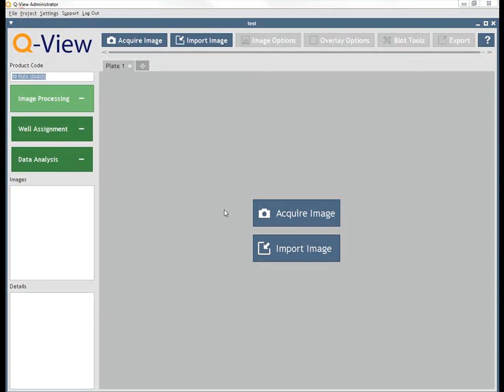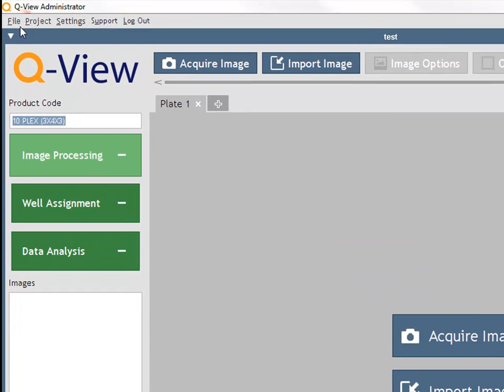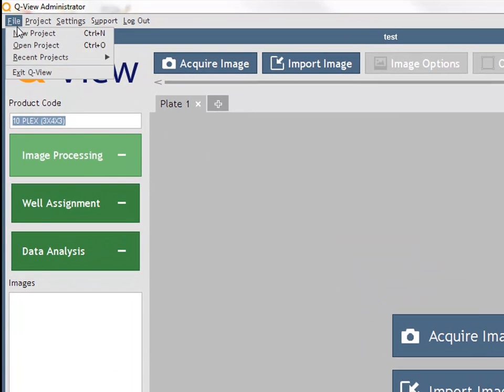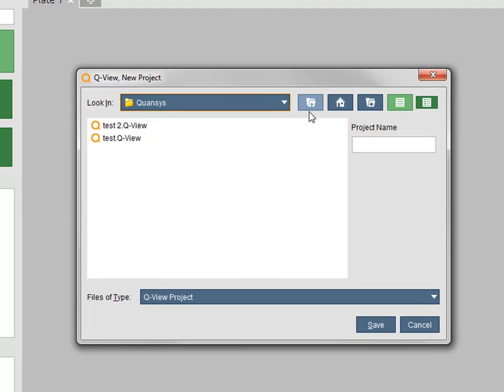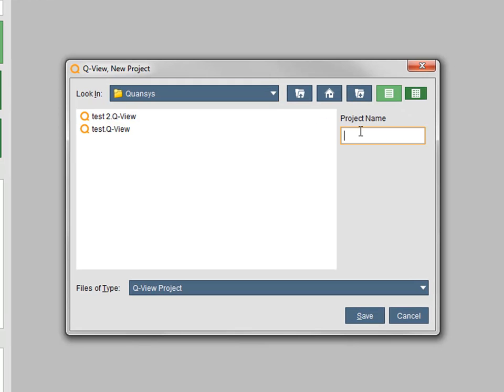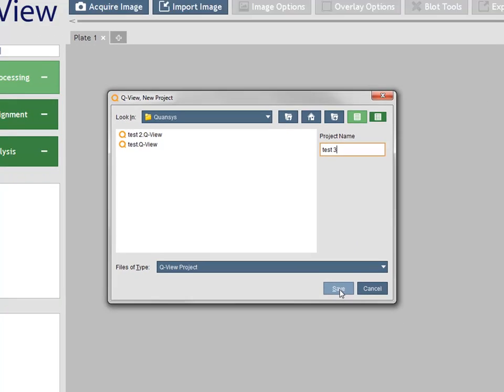To create a new QView project, click File New Project. A window will appear that allows you to choose the saved location and project name. Click the Save button and the project will be created and appear in QView.